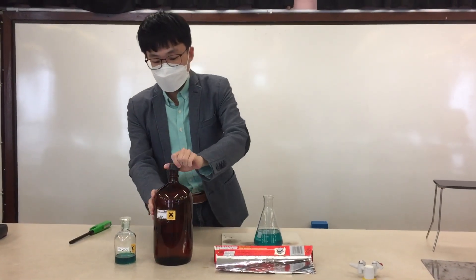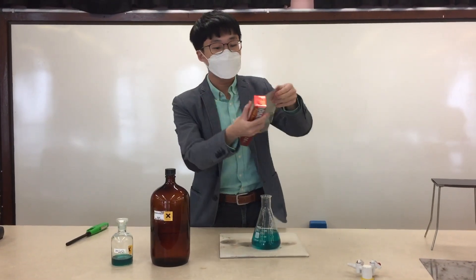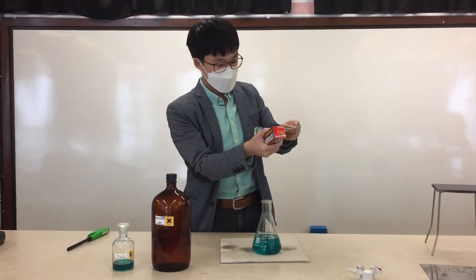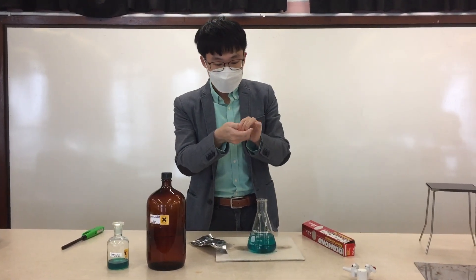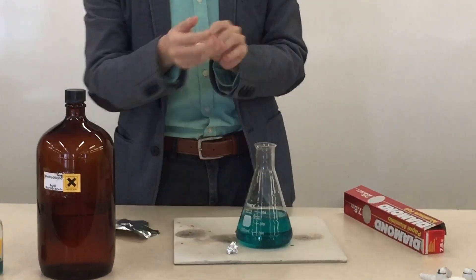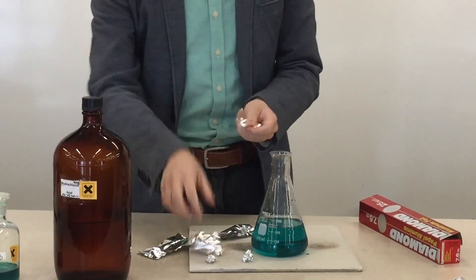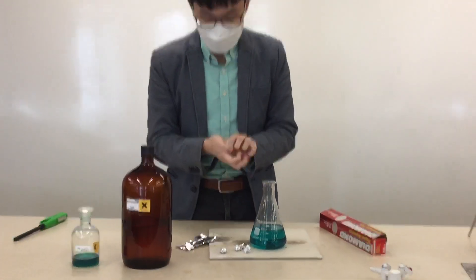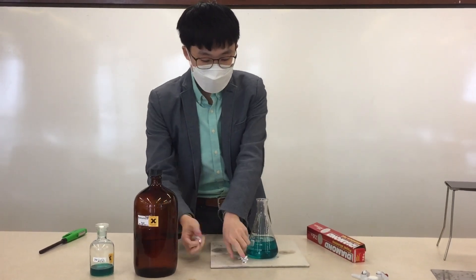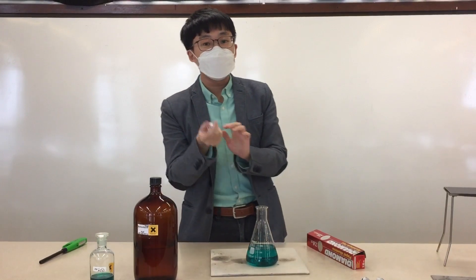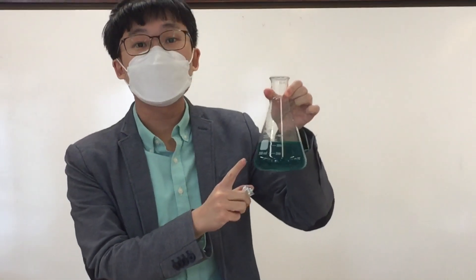After that, we have some aluminum foil here and we are going to make some aluminum balls. We are going to add these aluminum balls into the mixture of copper(II) chloride solution as well as hydrochloric acid inside.